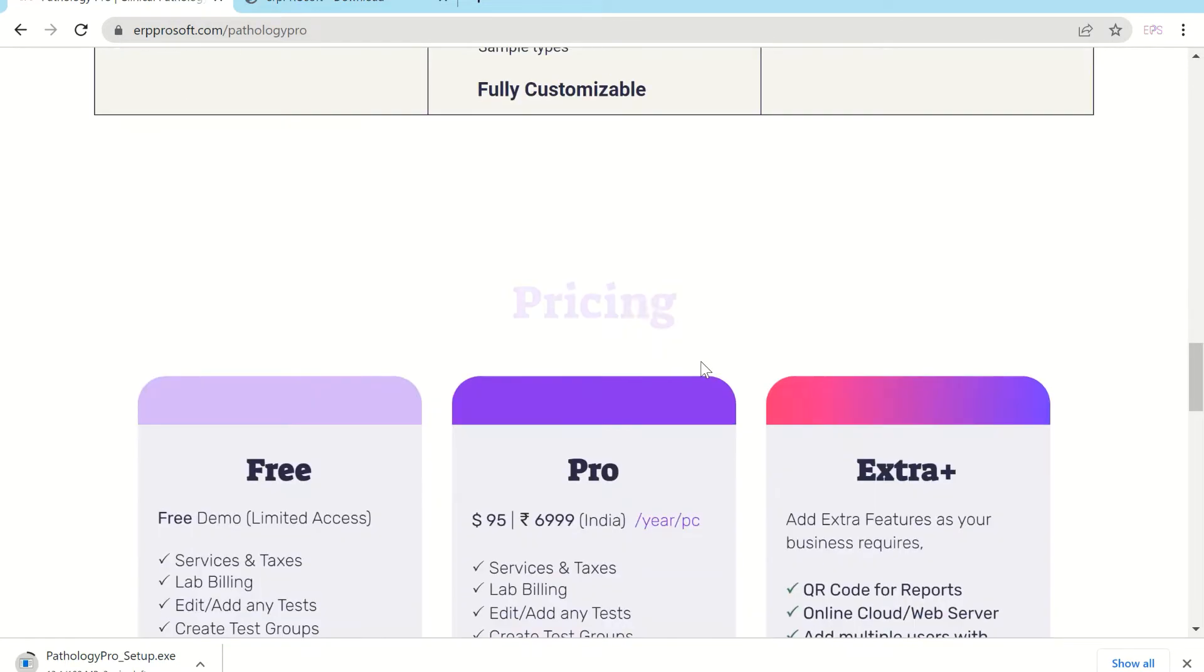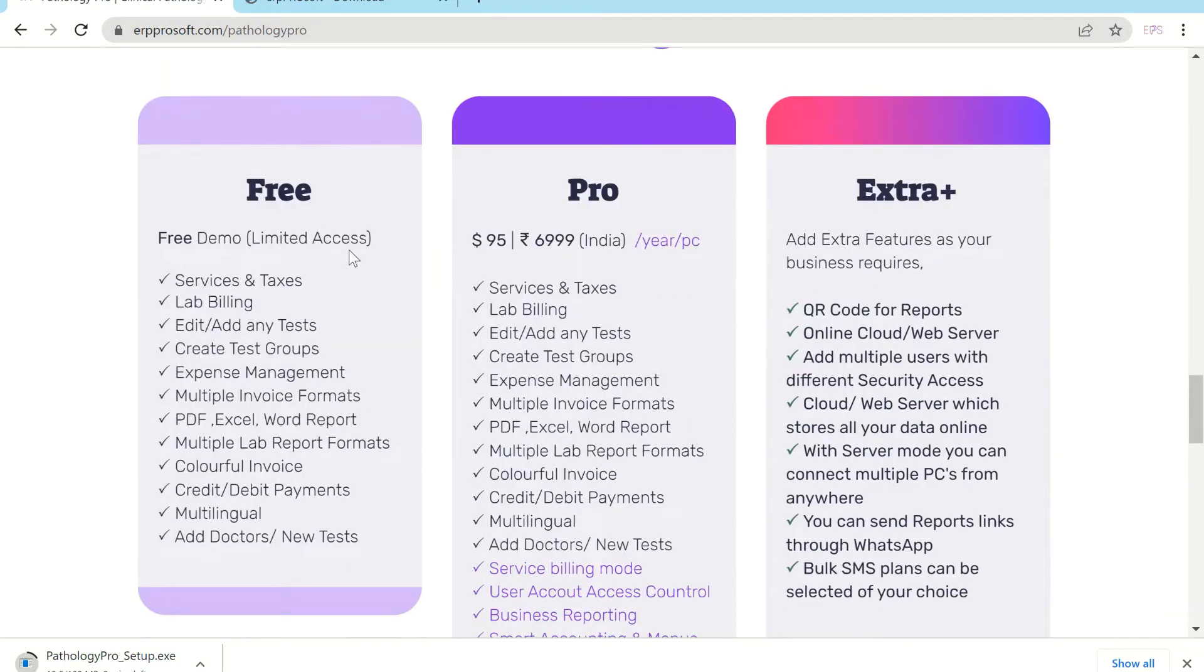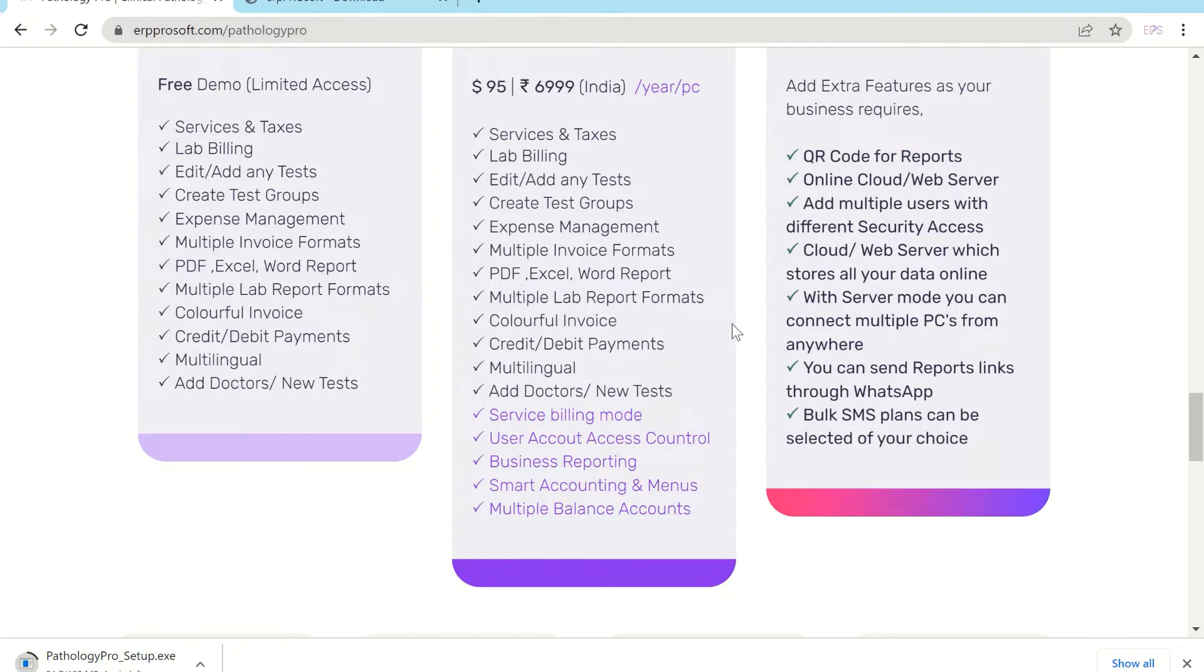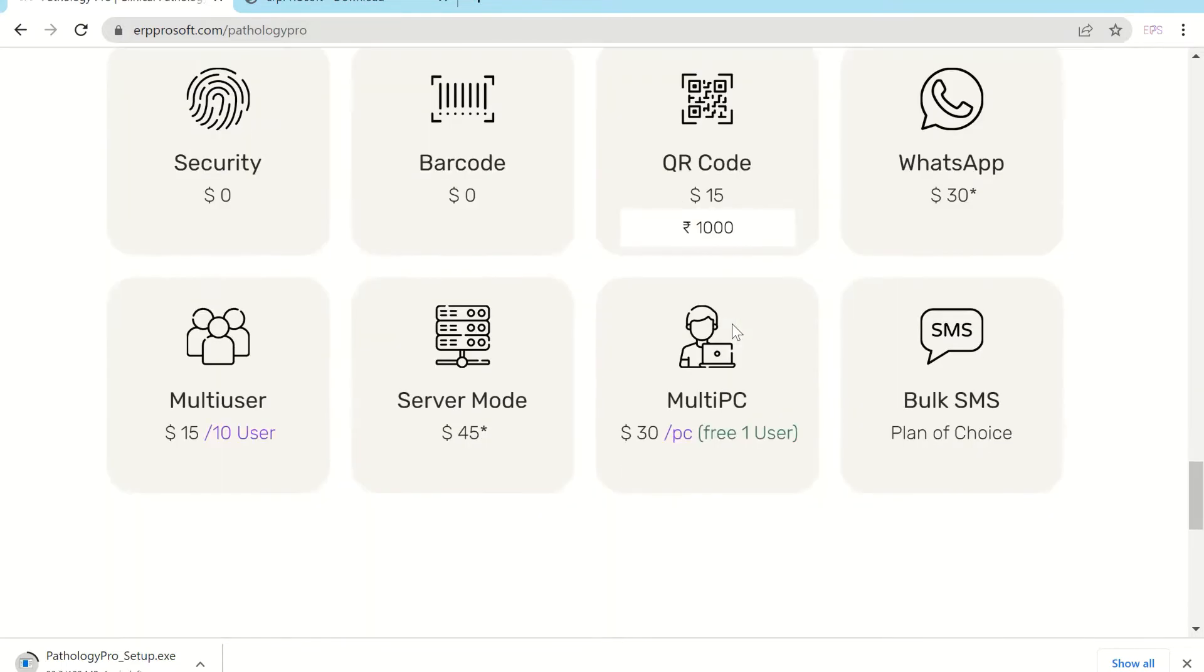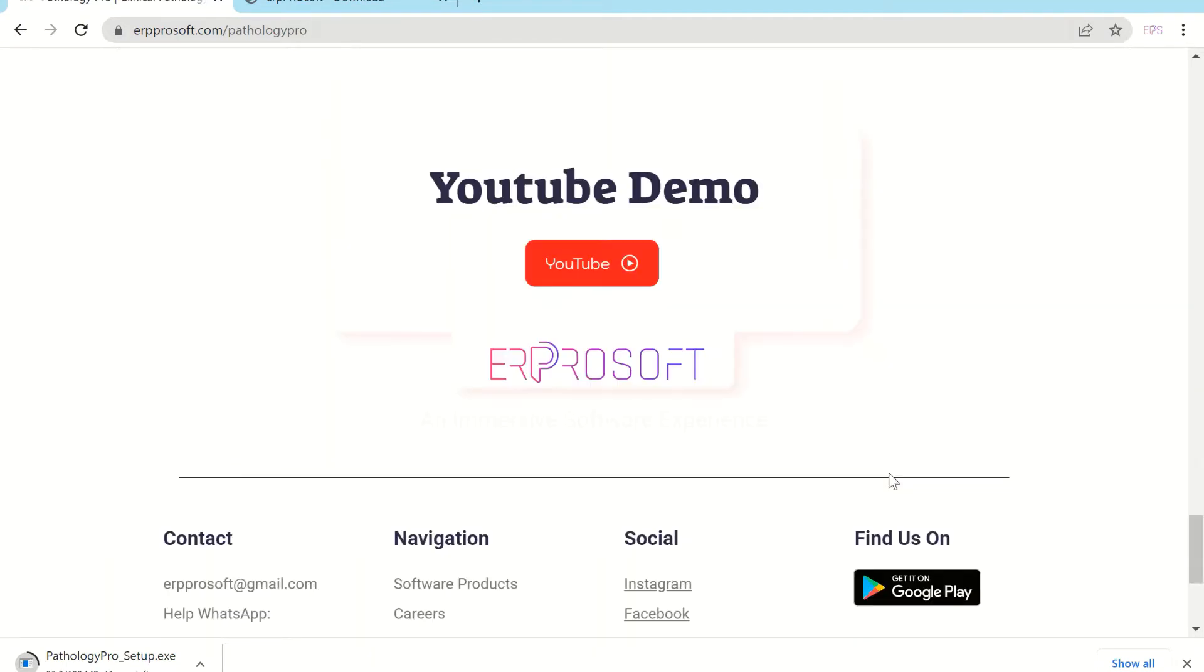You can download and use the software free with limited access. You can select premium features as your business requires like multi-user, multi-connectivity.